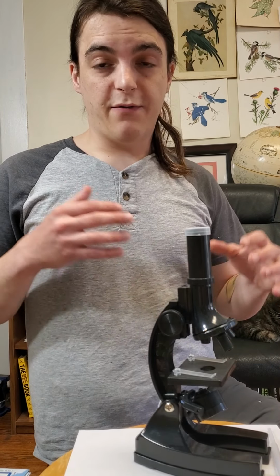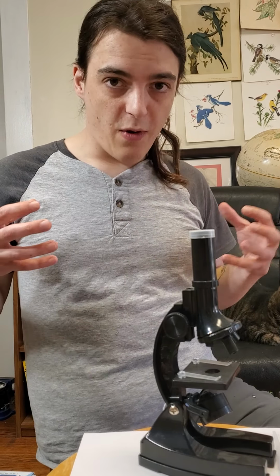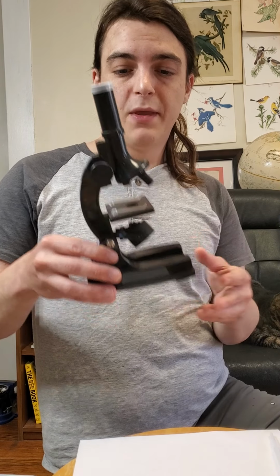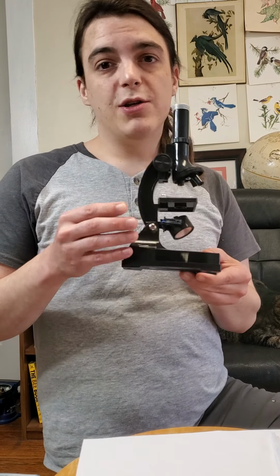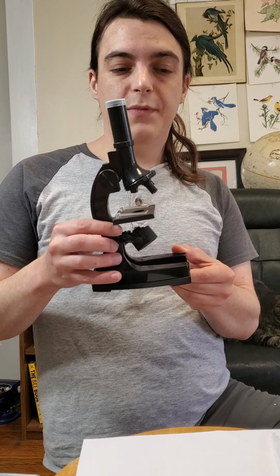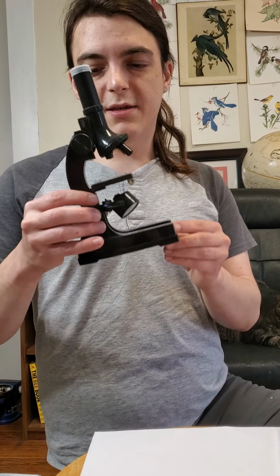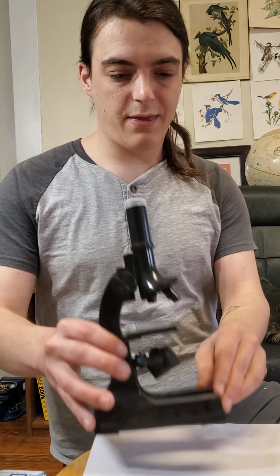We're going to look at some different things under a microscope, and see how things look different when you zoom them right up, kind of like when we zoomed up that aquarium water and could see some little things in there. Most microscopes like you might have at home probably can't see things as small as bacteria or algae like we saw last time. They're more likely to show you the ridges on your fingers, the grains of wood, or little parts on an insect. They're really good for that, but they probably don't zoom up to the point where you can see microscopic things.